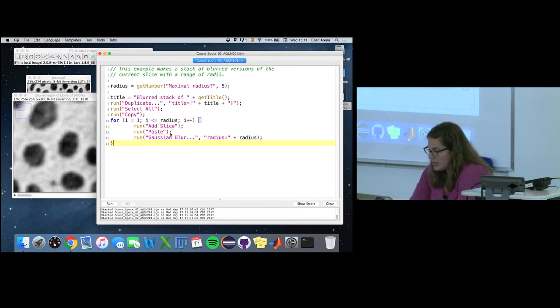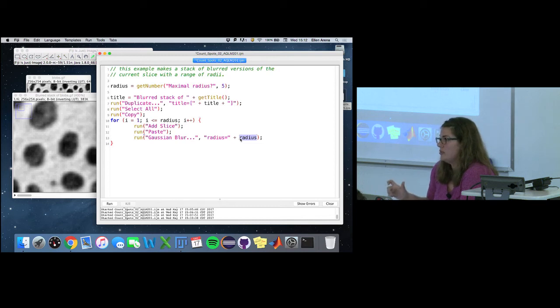But the issue actually comes up here with this call, this Gaussian blur. Do you see the issue? Each time we run through the for loop, we want the sigma of the Gaussian blur to change. We want it to start at 1, then go to 2, then go to 3. But if we look at our result, we see a blur is applied, and then nothing's changing.